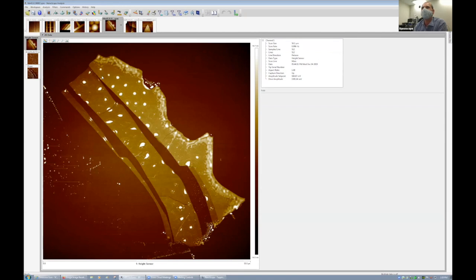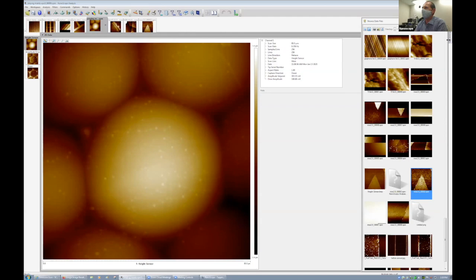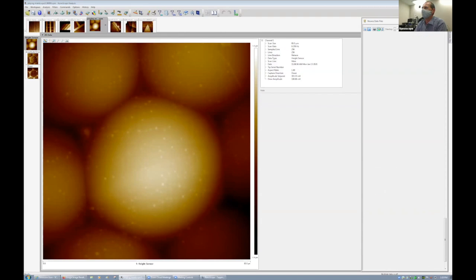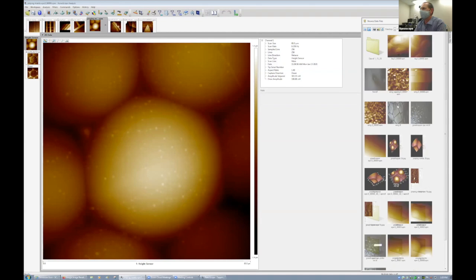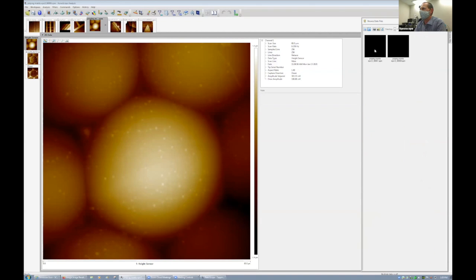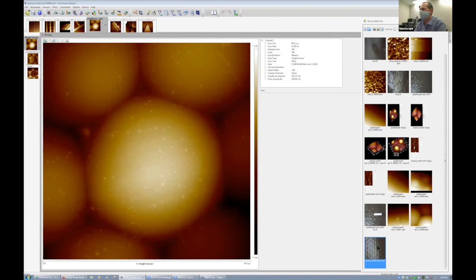With Angela, we did a demo for high school students in January, and they wanted to see praying mantis eyes. I should have a picture somewhere here. Here it is.